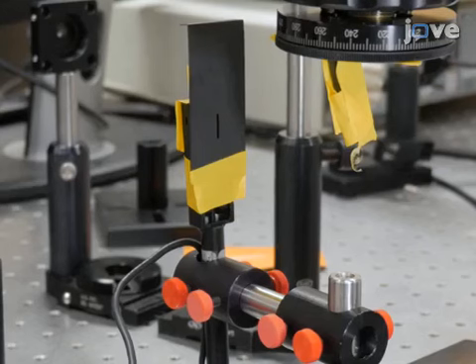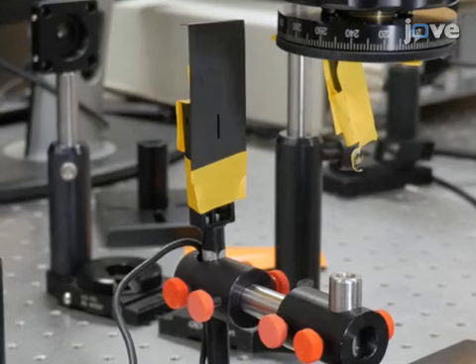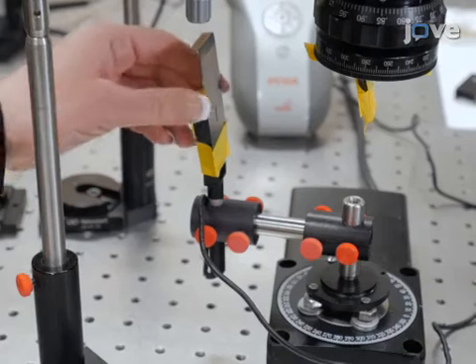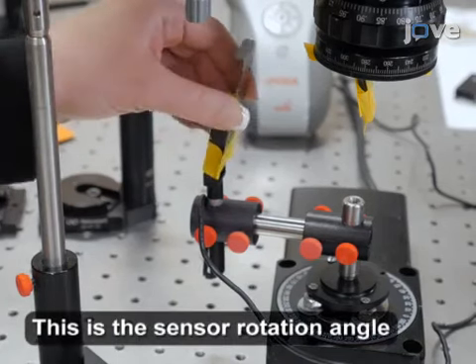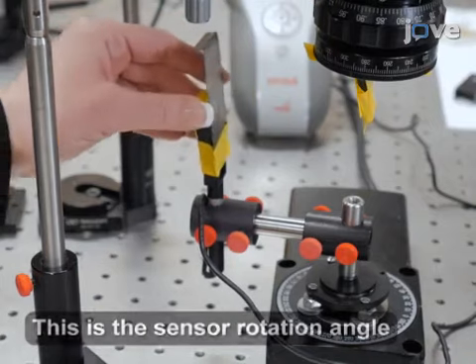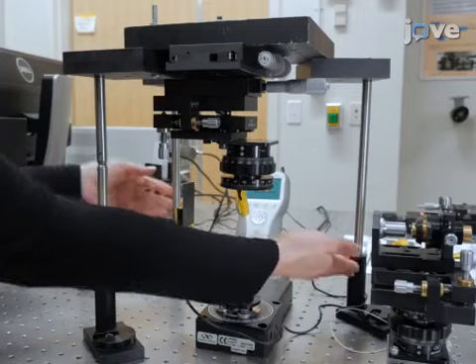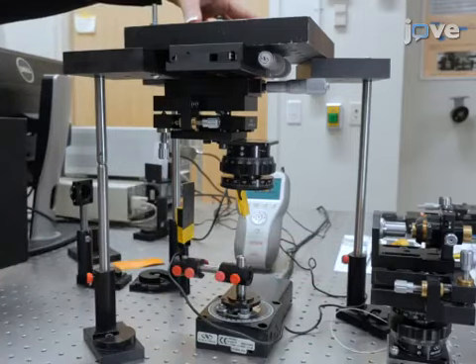A photodiode mounted at the end of the stage's extendable arm is the Goniophotometer sensor. It is supported on a mount that can be adjusted by at least 45 degrees to measure different planes of scatter. Construct a platform to hold the intraocular lens above the Goniophotometer.